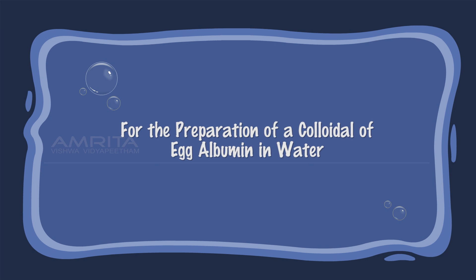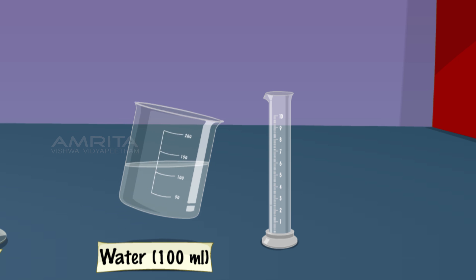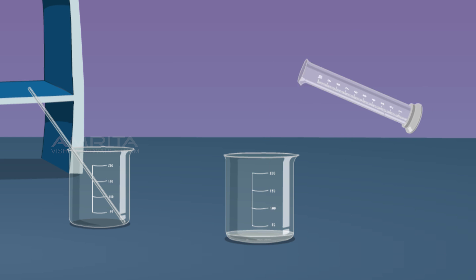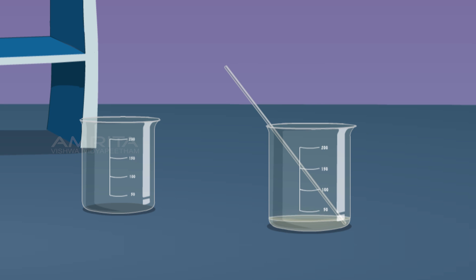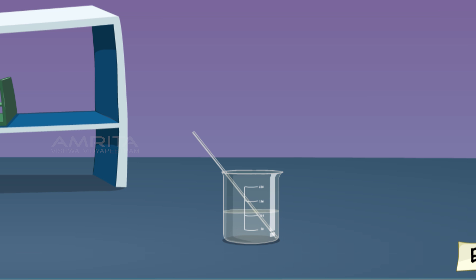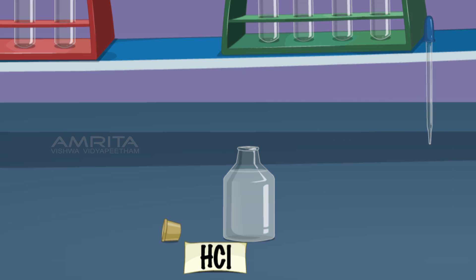For the preparation of a colloid of egg albumin in water, take 1g of egg albumin in a 250ml beaker. Take 5ml of distilled water from another beaker containing 100ml distilled water and pour it into the beaker containing egg albumin. Mix well using a glass rod. Then slowly pour the remaining 95ml of distilled water into the beaker containing egg albumin and stir well. A clear solution is obtained. Add a few drops of dilute HCl and stir; the clear albumin solution becomes turbid.